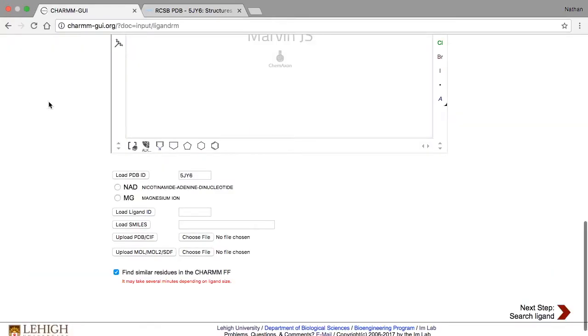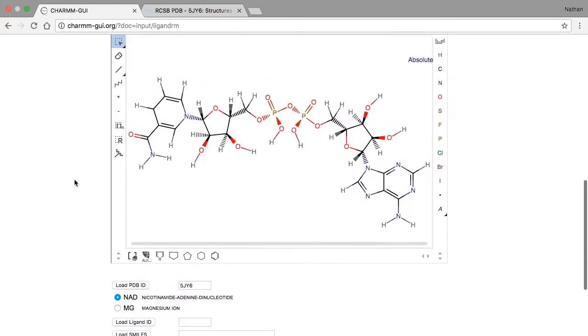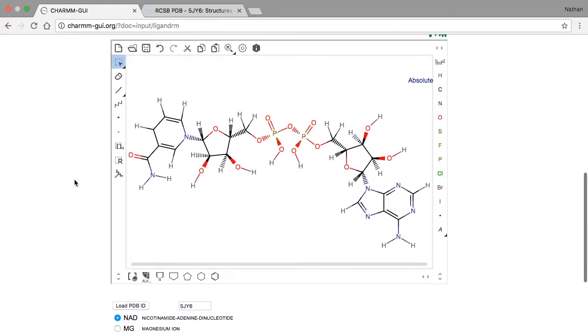When LigandReader finishes, it will list both of these. NAD is the one we're looking for, so we'll select it. This loads the structure into the canvas.